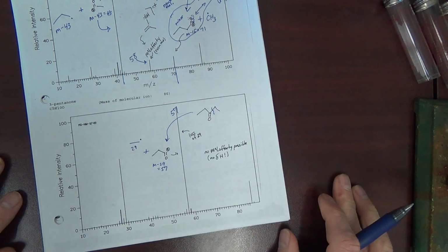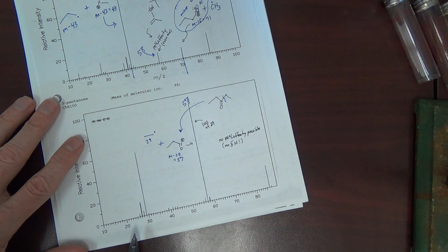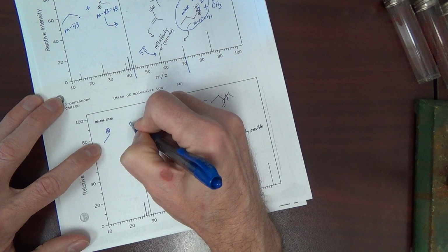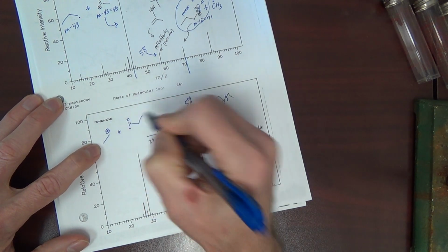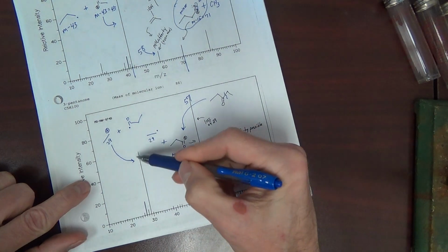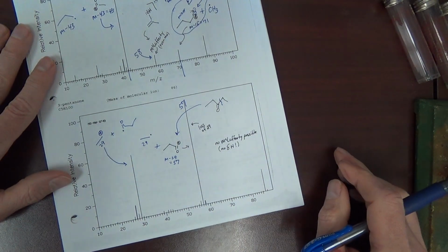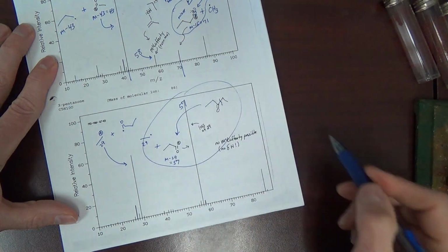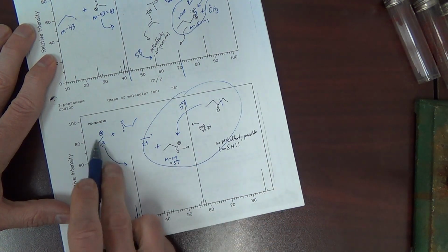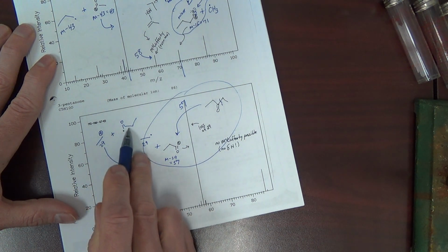Very nice example here. We also have a peak at 29. What could that be? I would have to say that that's where we cleave at the same spot, but for some reason the cation formed on that carbon and left the radical there, and then this is 29 because it's a cation, it showed up. I would not expect that to be as tall. Of course, there's often things we see in mass spec that we might not really expect. It's a high energy process. This is what we predict. I'm surprised that that peak is as tall. That cation's not stabilized. This may have some stability here, but that's unexpected.